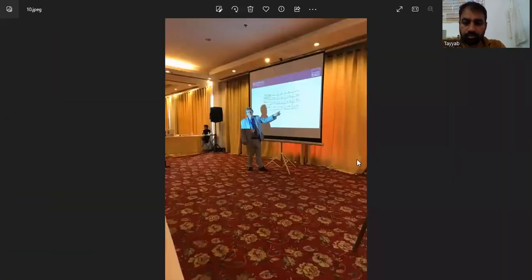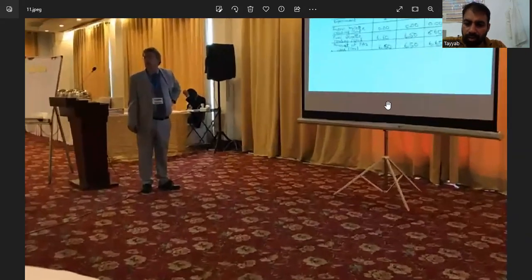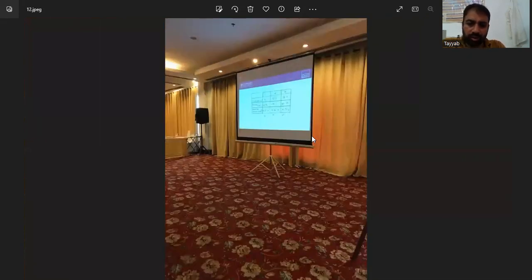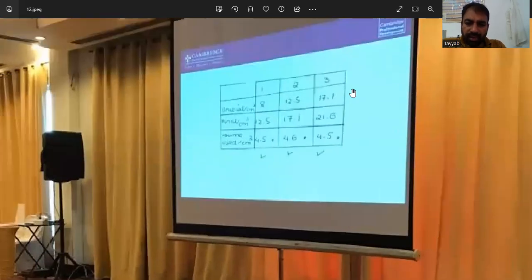Now I would like to go on to the next PPT. Yes, we discussed this. The initial volume is taken as 0.00 cm³, more than 0.00 cm³. What is in this video? Yes, in this picture, what is wrong with this? These are all incorrect. No marks will be given for this.